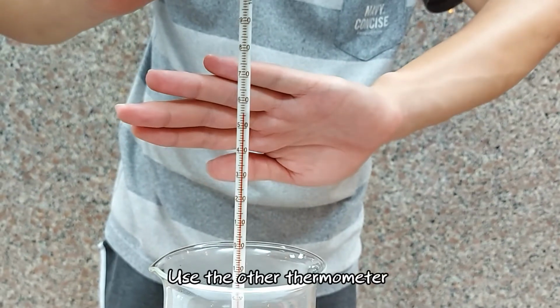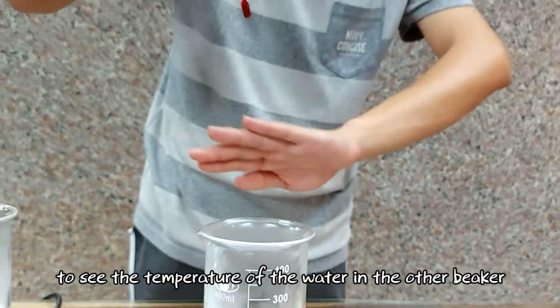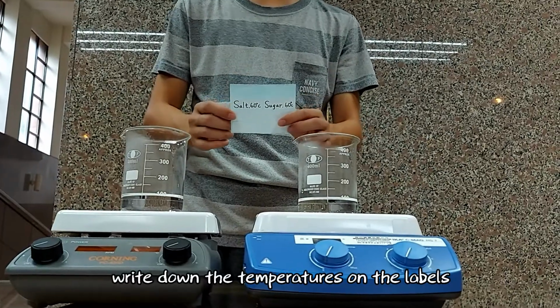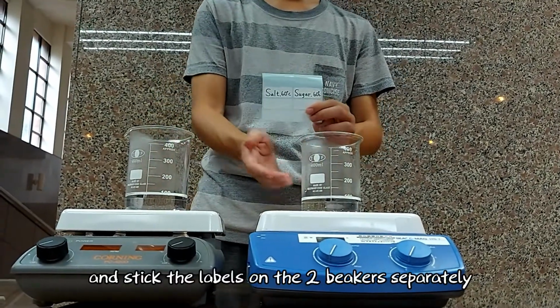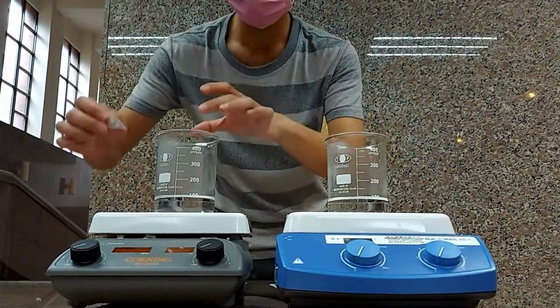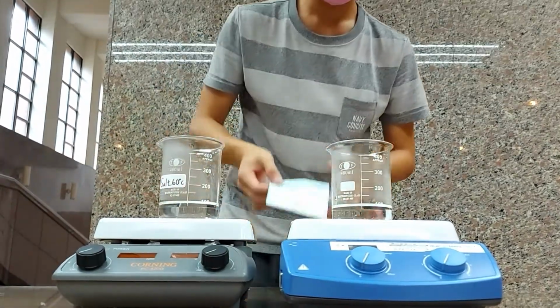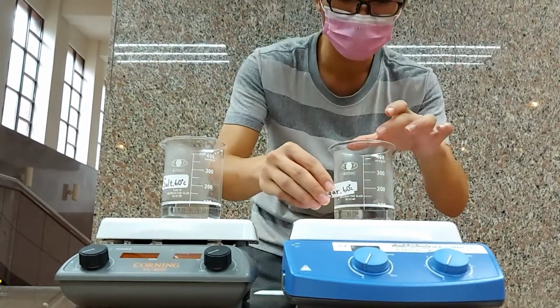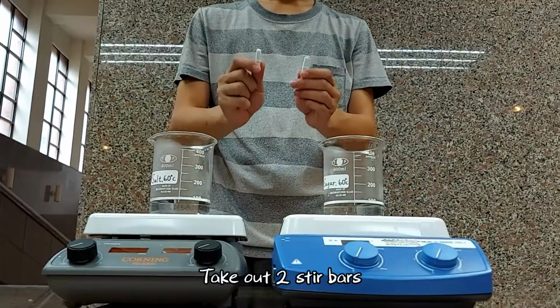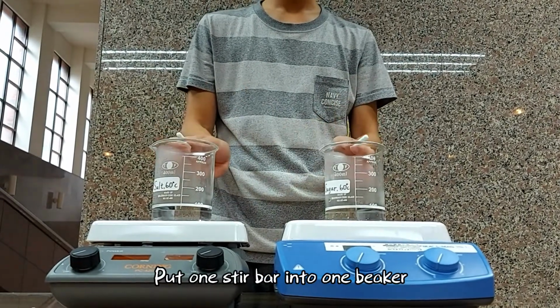Use the other thermometer to see the temperature of the water in the other beaker. Write down the temperature on the labels and stick the labels on the two beakers separately. Take out two stir bars. Put one stir bar into one beaker.